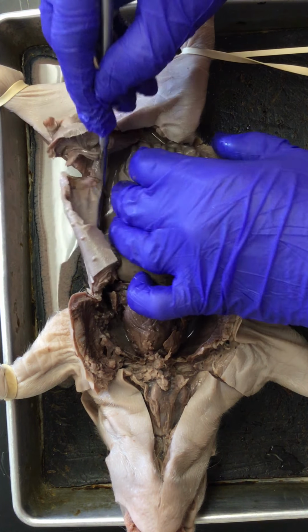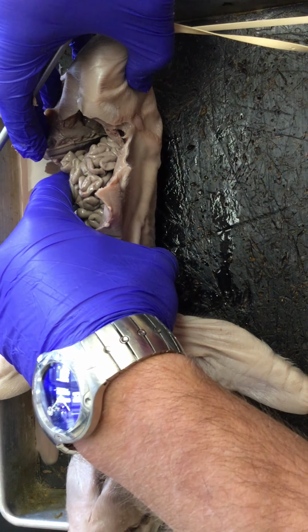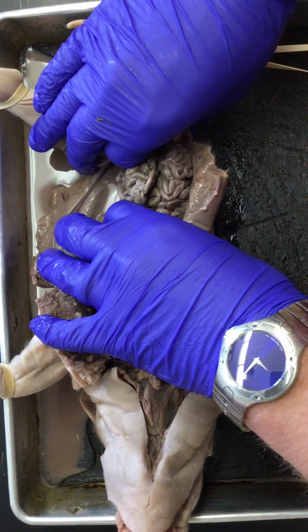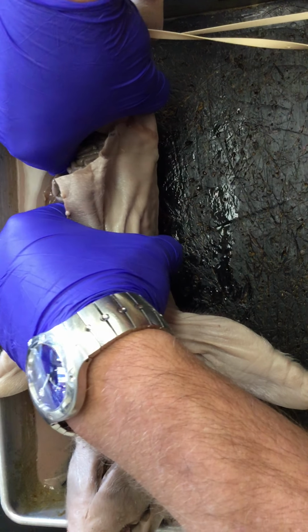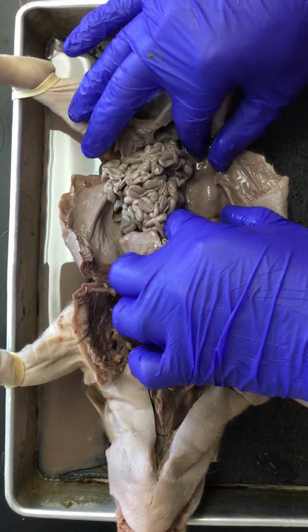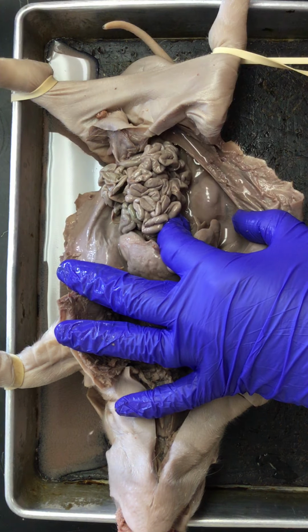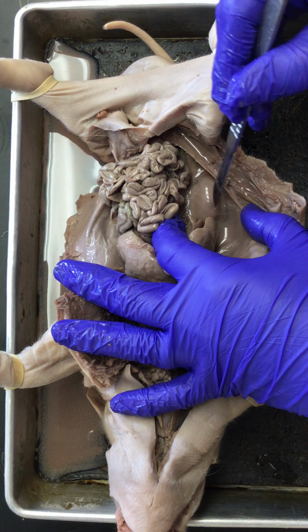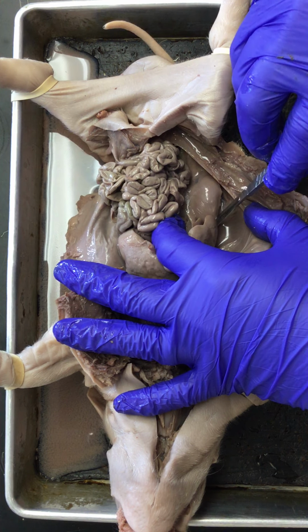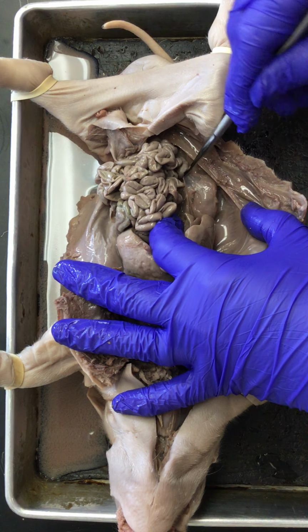Other things of note will be the kidneys. I have to drain this pig a little bit in order to see the kidneys. Also, the kidneys will require a few more cuts. So I've really gotta drain the pig. And then we'll do this side. I'm not sure if you can see it in the camera, but there's a bulge right here. This bulge is actually the kidney. And so what we'll do right now is we'll cut away the connective tissue that is holding this kidney in place. Really carefully. Let's see if I can just lift it away to reveal the kidney. There we are.